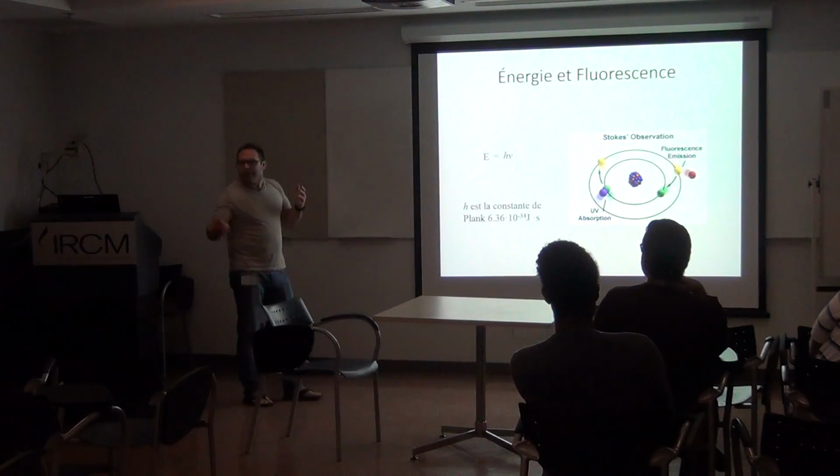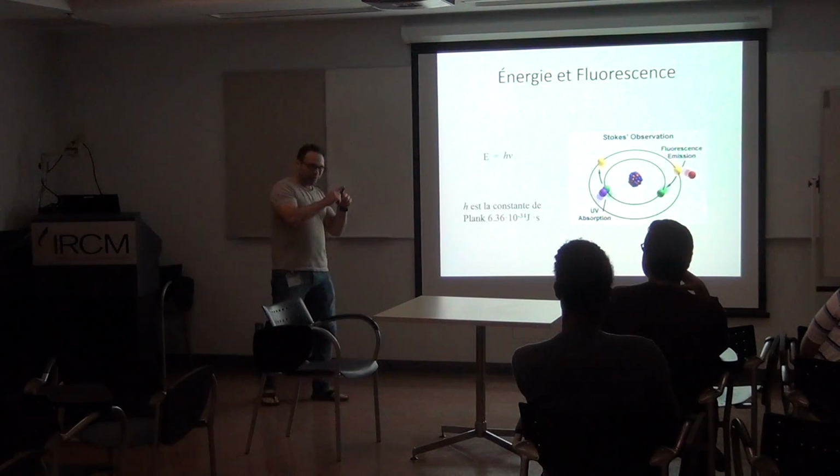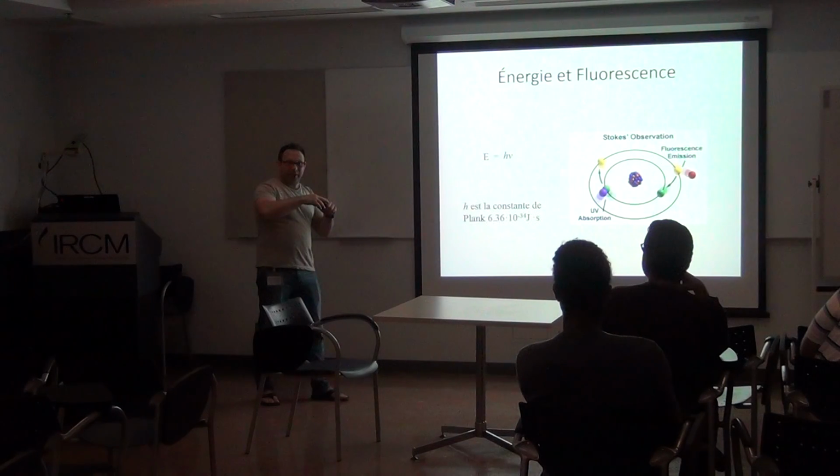And when we use a confocal microscope, we shoot a laser. The amount of time is 10 to the minus 6, so 1 microsecond. Okay, so 1 microsecond is still long, because we can see about 1,000 fluorescence events in that time.